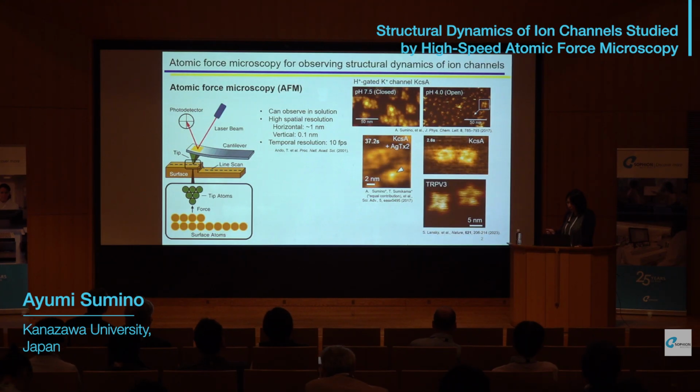And here is from a different group, but they captured the tetrameric structure and the pentameric structure of the TRPV3 channel in reconstituted membrane.